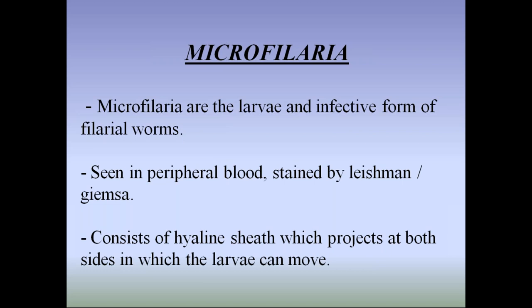Being nematodes, the male and female worms are separate. How to differentiate them? Males are differentiated from females by their small size and tail structure, such as spicules present in the posterior end, etc. By that, we can differentiate the male and female reproductive organs.